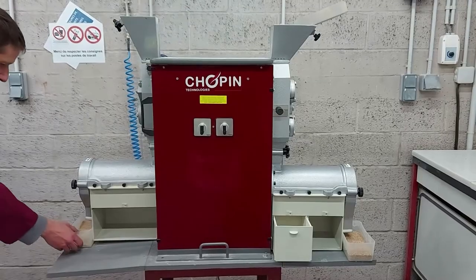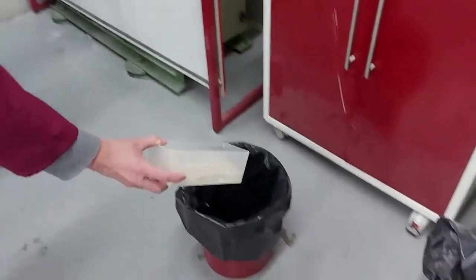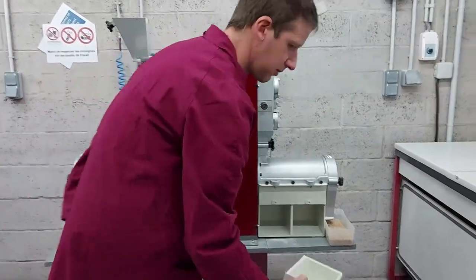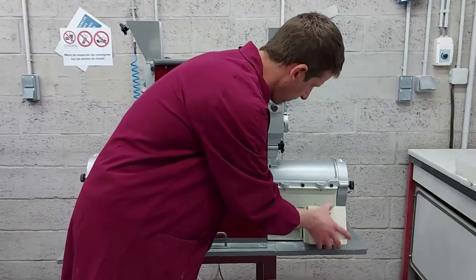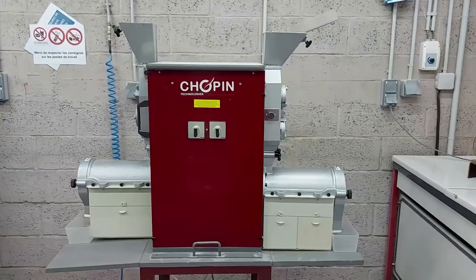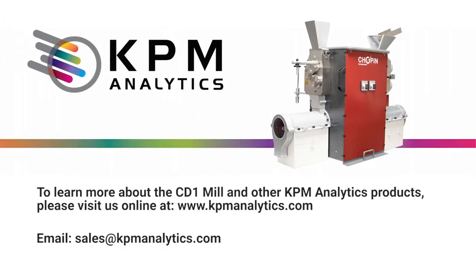When the test is complete, cleaning is very simple, and consists of emptying the content of the various product collection bins. Then put these boxes back on the instrument. I hope this demonstration was useful. For more information about our products, please visit us at www.kpmanalytics.com. Thank you.